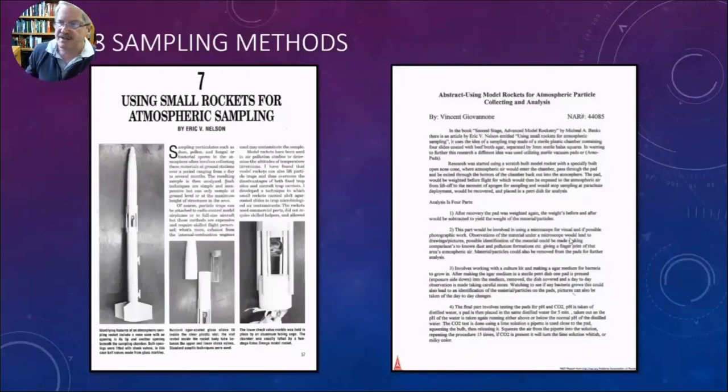So in both cases, basically as the rocket moves through the atmosphere, any microbes or any other particles for that matter are slamming against the collection medium. And this works great. And in fact, in some ways, it works better than my system that we'll see because these get a lot more airflow. What they don't do is give you a calibrated airflow. So if I want to know how many microbes are in 10 liters of atmosphere, my system can do that by simply turning on and off at appropriate points. Both of these, basically, are open during launch and then they close during recovery. And so you're getting sampling through a column of air. And again, there's nothing wrong with that, but it does provide some limitations on experimental design. So what I want to say is there's no one way to do this that's going to work for every situation.